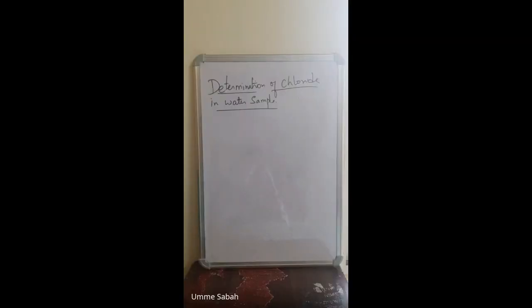So here also we are doing volumetric titrations. If you write the apparatus, it will be better. So please write the apparatus so that you will get to know what exactly we are supposed to do. Volumetric titrations are happening here. Apparatus, that is the requirements we want.